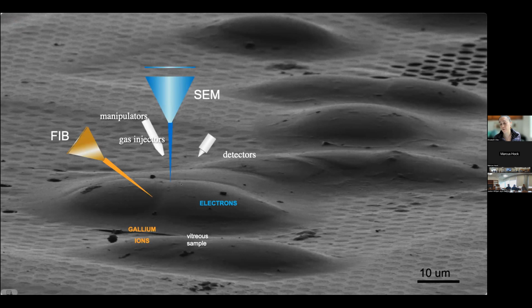And the idea is that the scanning electron microscope, as opposed to a transmission electron microscope that has high energy electrons that go through the sample, basically just bounces off the sample. You detect the backscattered electrons. And these are the kinds of images that you get, same as fly eyes or a bed bug in your doctor's office. The focused ion beam, the other beam in this, is the same, except it has positively charged ions, so much more massive than electrons. And you can get these kinds of images. So this image of HeLa cells on the grid is actually from the focused ion beam.